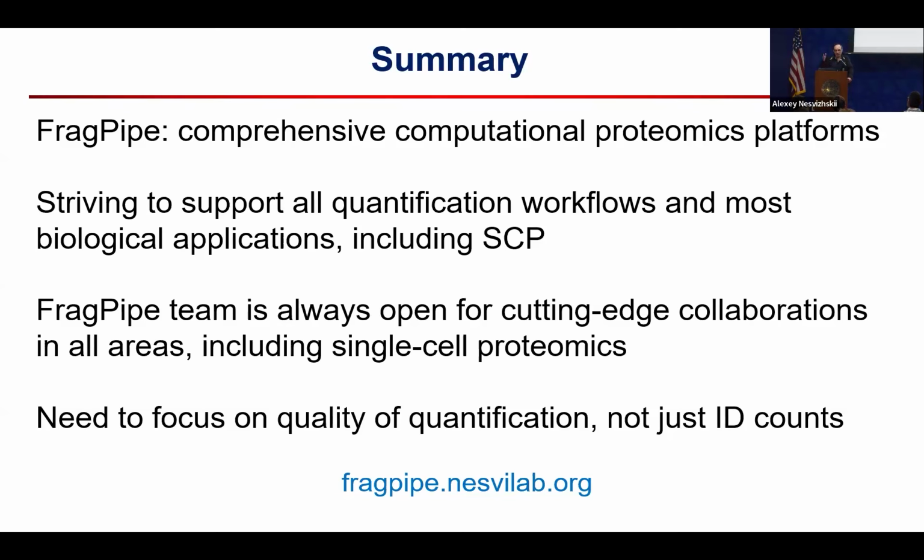I think because the MS1 has so much stuff in there already, so much noise, having MS1 as a filter, okay, we don't see the precursor, we don't consider this peptide, actually helps us. So we're not even losing, we're only gaining.